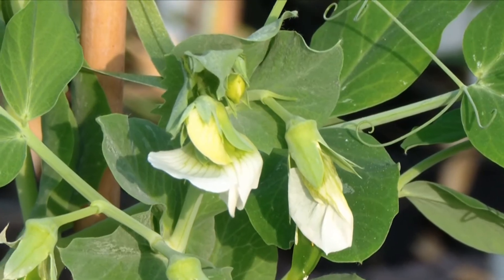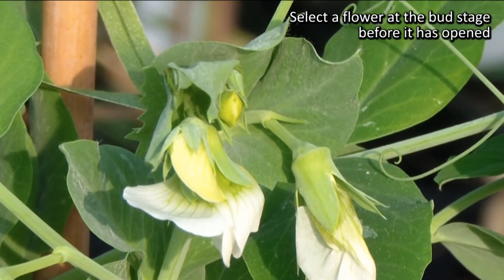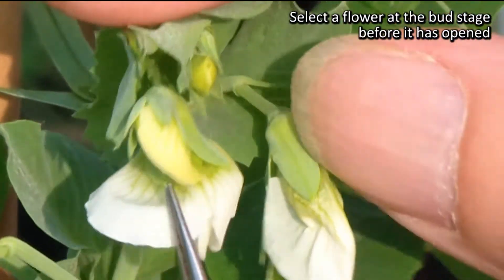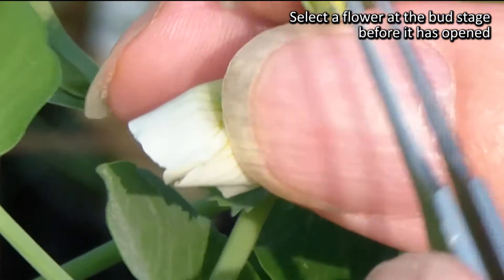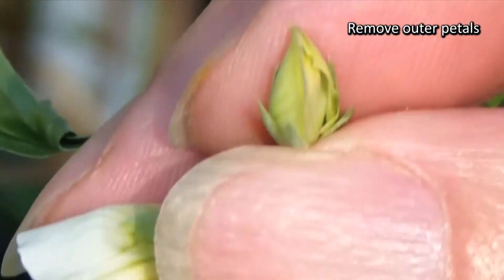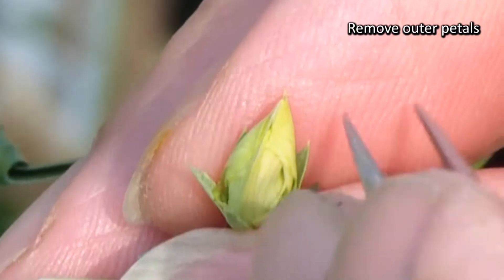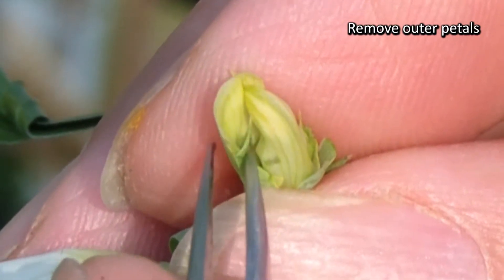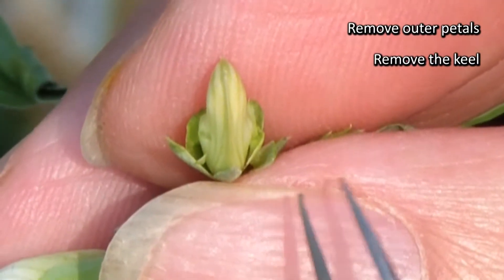I'm going to go through the process again. First of all, you select your female recipient flower and you're looking for a flower that's at the bud stage — here's a good one here. You hold the flower in its correct position and strip off the petals going from the base of the flower, going either side of the keel, pulling the outer petals off first. And there's the keel with all the anthers and the style inside.